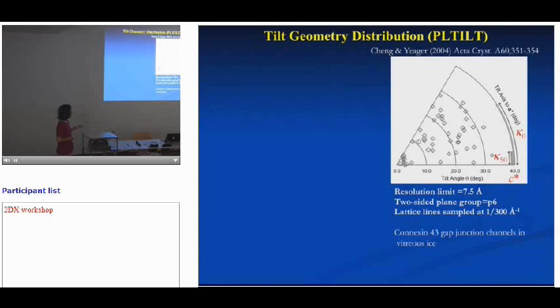The other thing that I put down here is this little scale bar. Those two numbers are calculated according to the resolution that you want the data to go out to, as well as the thickness, your lattice parameter C. Basically, what it's telling you is that if I have two images whose tilt axes are separated by this much, and it's tilted to 40 degrees, then I have just enough overlap at my highest resolution.